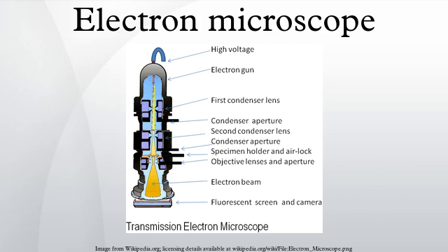The advantages of electron diffraction over X-ray crystallography are that the specimen need not be a single crystal or even a polycrystalline powder, and also that the Fourier transform reconstruction of the object's magnified structure occurs physically and thus avoids the need for solving the phase problem faced by the X-ray crystallographers after obtaining their X-ray diffraction patterns of a single crystal or polycrystalline powder.